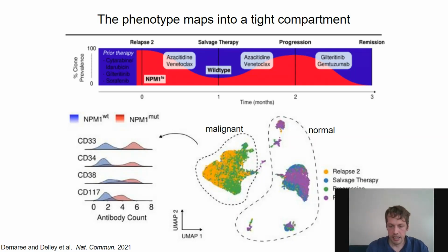And even more interestingly, we have a very clear separation in the immunoprofile of the CD33 marker between the healthy cells on the far left and the cancerous cells in red. This is particularly interesting, I guess, in this case for clinicians, because there's an antibody drug targeting CD33, and since these cells separate so well, that makes this patient very much amenable to treatment by this kind of drug. And indeed, that's what has been used on this patient at the final time point. It's called gemtuzumab. And as you can see, this puts this person into remission. So that was a great success.